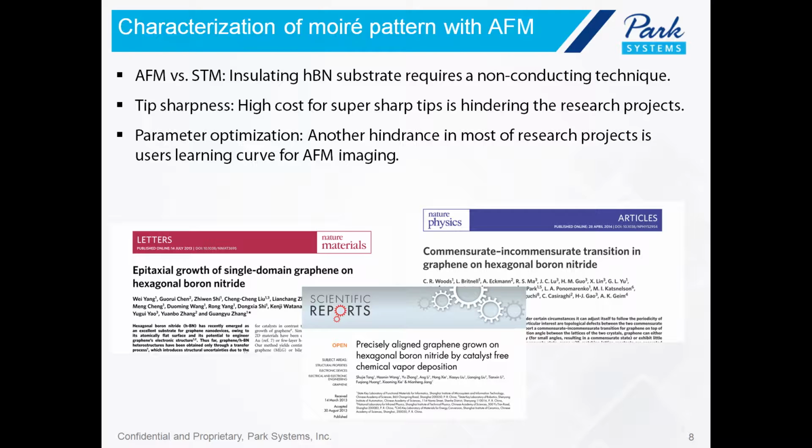in your final image. The trade-off being, though, that if you run it in contact mode or tapping mode AFM, you tend to wear down your super sharp tips much quicker. And the cost, as many of you who work with AFM already know, the cost for super sharp tips, especially in volume, can definitely hinder research projects with limited funding.